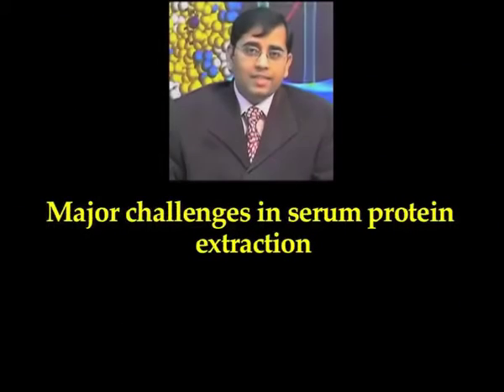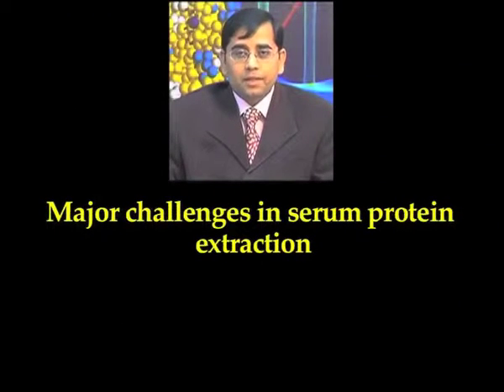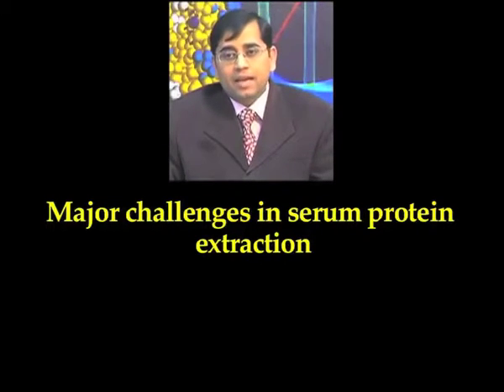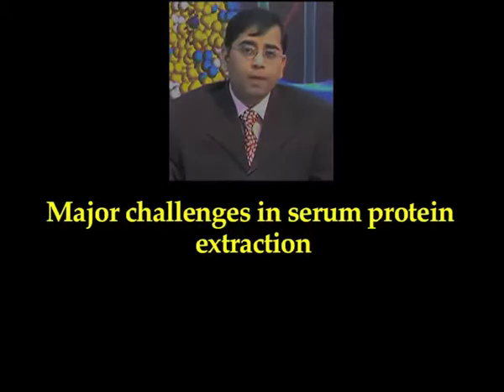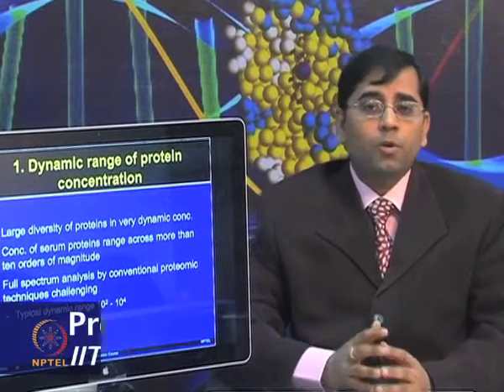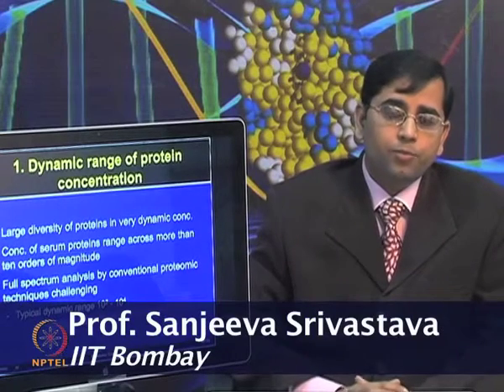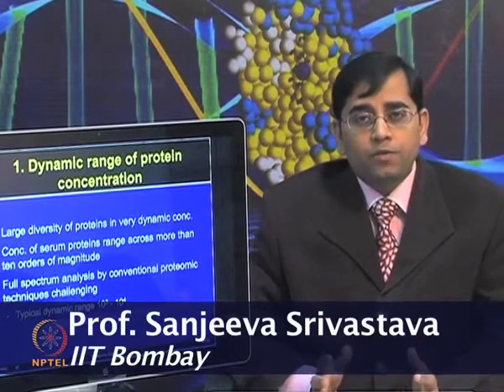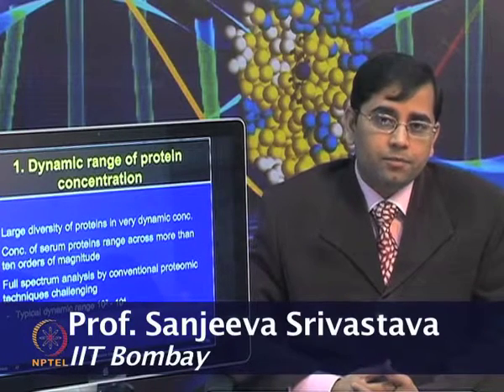Although sample removal is easy, sample analysis, the serum or proteome analysis, is not so easy. There are major challenges in serum or plasma proteome analysis. Let us talk about some of these challenges point-wise. The first point, the dynamic range of the protein concentration.